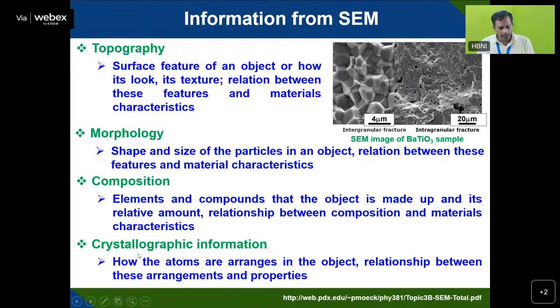You can also get how these atoms are arranged in the object, and how that arrangement gives rise to different properties. You can also get a little bit of crystallographic information from scanning electron microscopes.